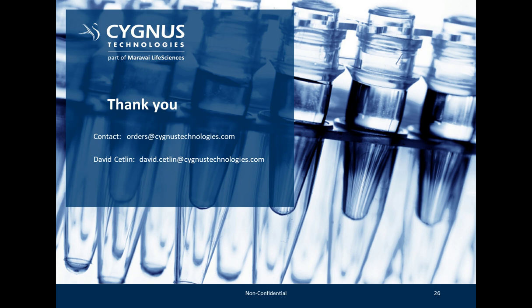Okay, great. And how does MVP LRV data compare to the MVM spiking studies? Yeah, so that's the whole holy grail here. You saw in the slide deck 3 different studies. 2 of those had comparable MVP versus MVM data built into that. We actually have some other papers published by AstraZeneca and Asahi Kasei, which had the parallel style of reporting as well.